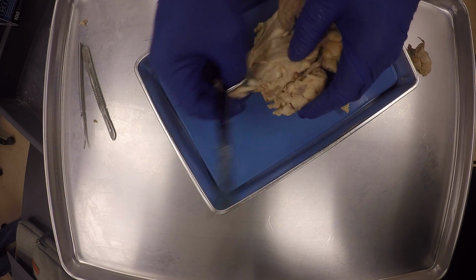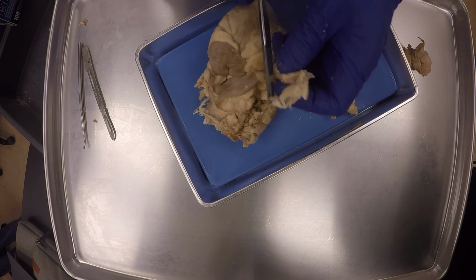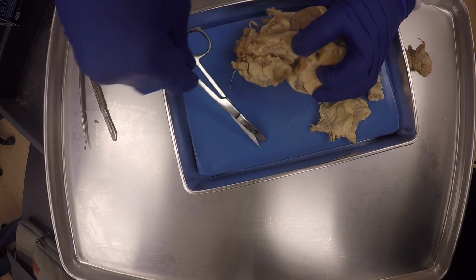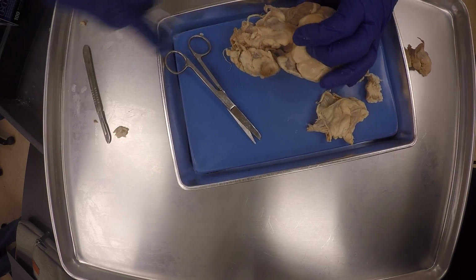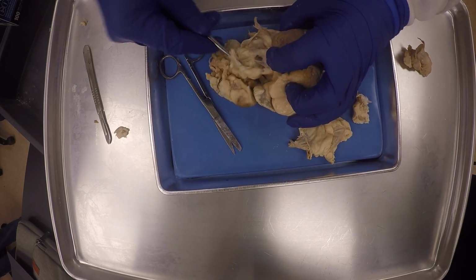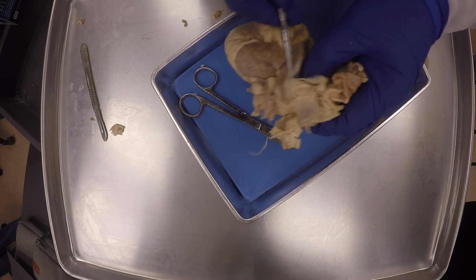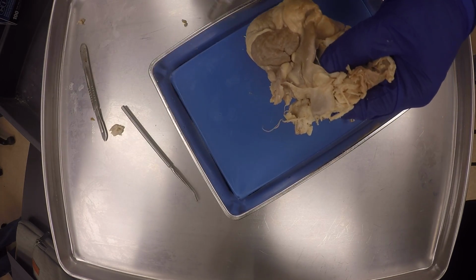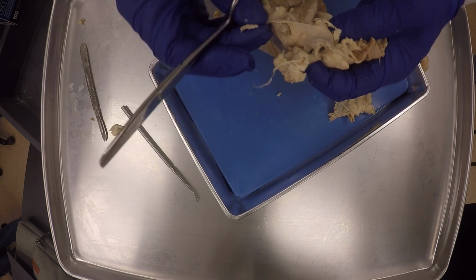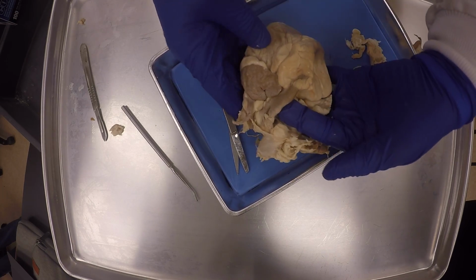So I'm just trying. Unfortunately, sometimes there's all this excess stuff. The thing is, you've got to be sort of patient with it. That's the only thing. I'm so sorry that it kind of takes a bit of doing. See the pulmonary trunk, this one.